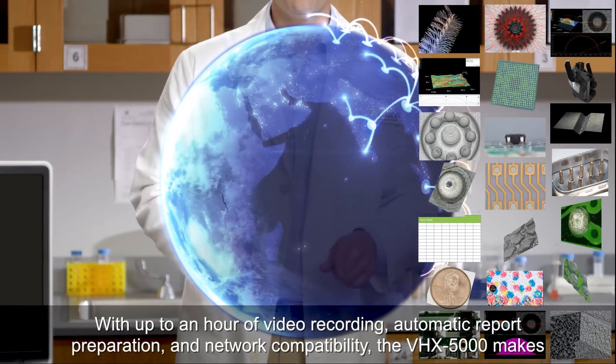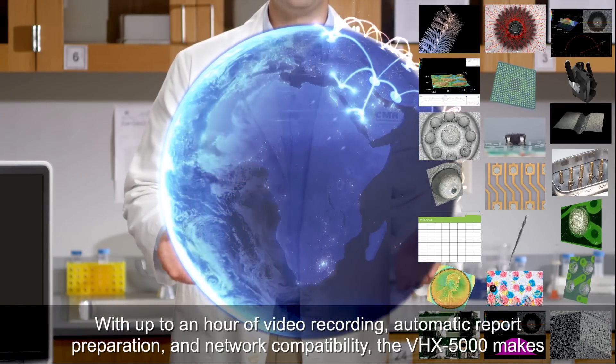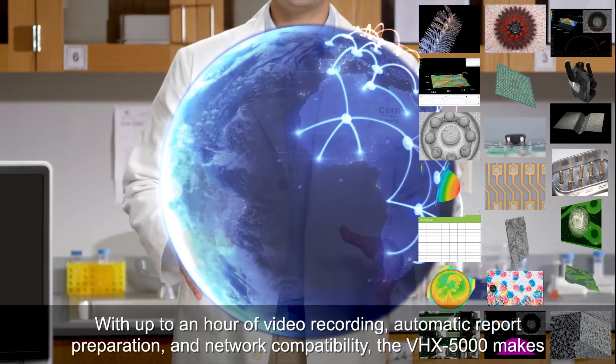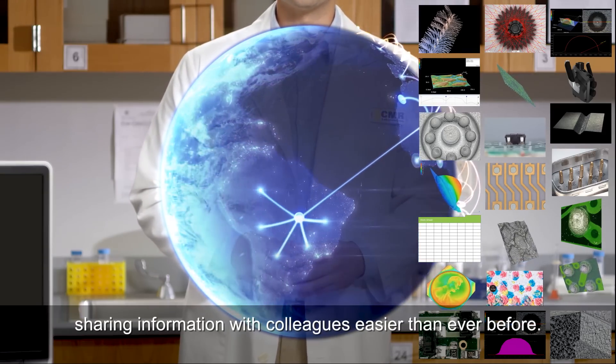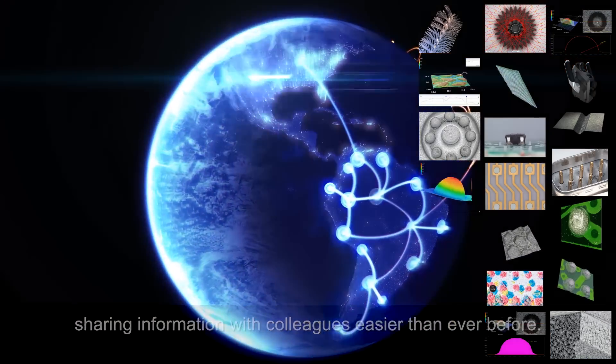With up to an hour of video recording, automatic report preparation, and network compatibility, the VHX5000 makes sharing information with colleagues easier than ever before.